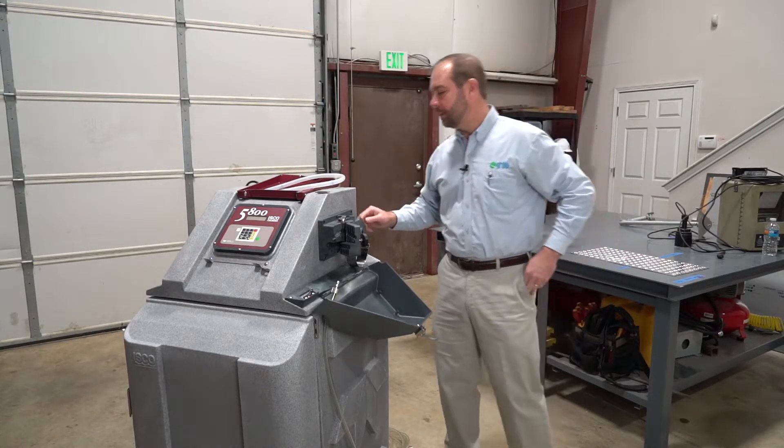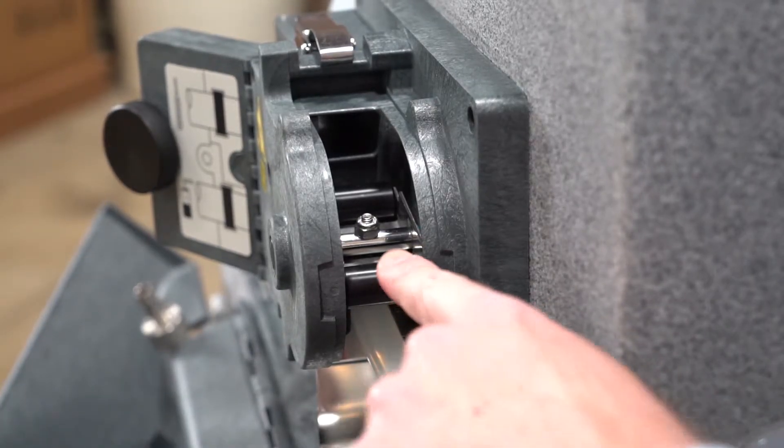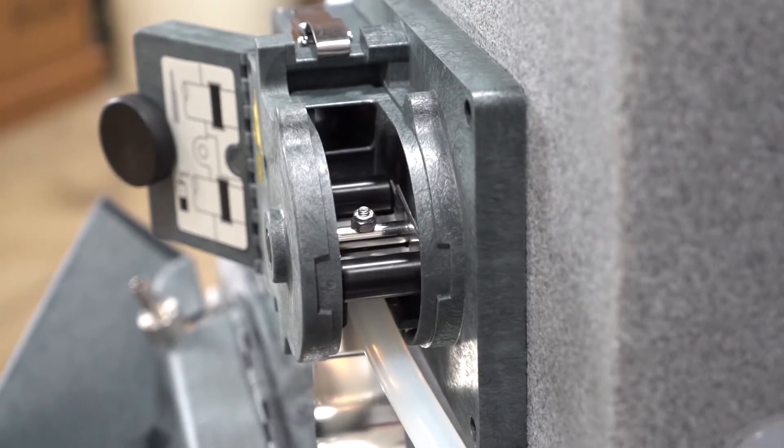Then we will inspect the pump rotor area for dirt and debris. This particular area you will want to clean with warm water and a soft bristle brush.